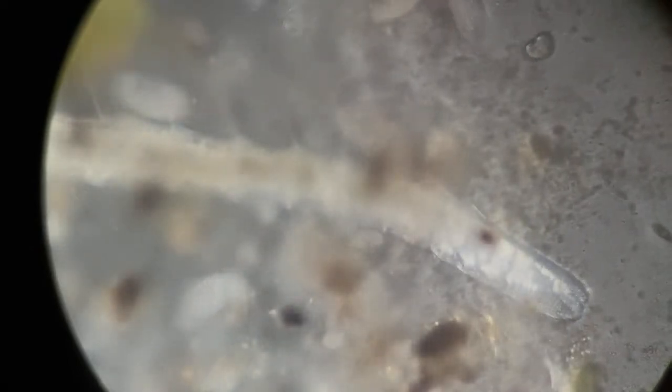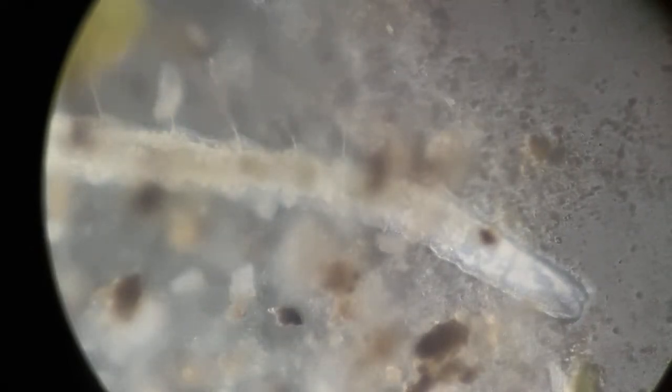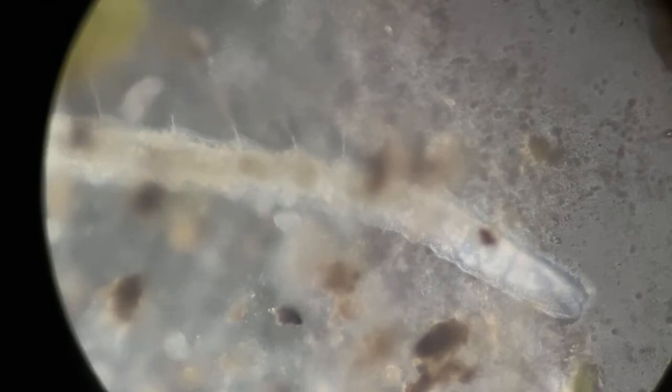Okay, I'll just tweak the camera a bit more, because somehow I'm not able to get the focus very perfectly. Suddenly the alignment has gone off track. Suddenly, and certainly. See those eggs at the tip? Those little granules.